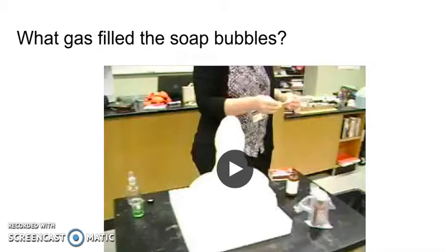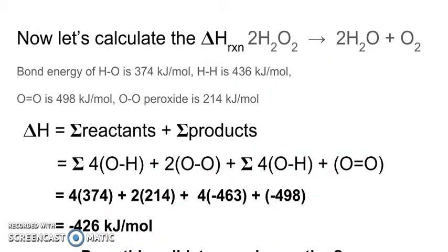So from this, we can see that oxygen gas really filled the soap bubbles, and it supports our prediction that oxygen gas is formed and not hydrogen gas.